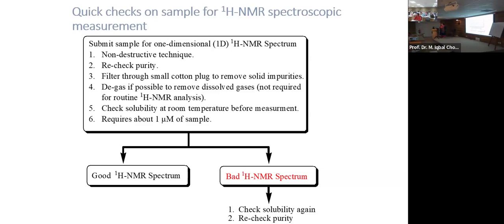In our research group, we have been doing enzyme inhibition. We have the substrate and the enzyme, and we design the experiment to see the diminishing of some signals and the increment of the product signals. That depends on time.